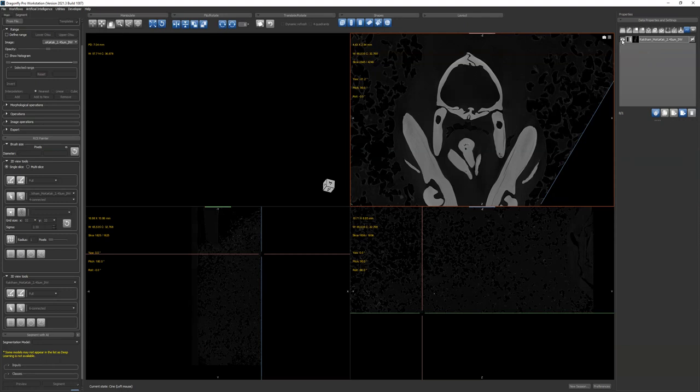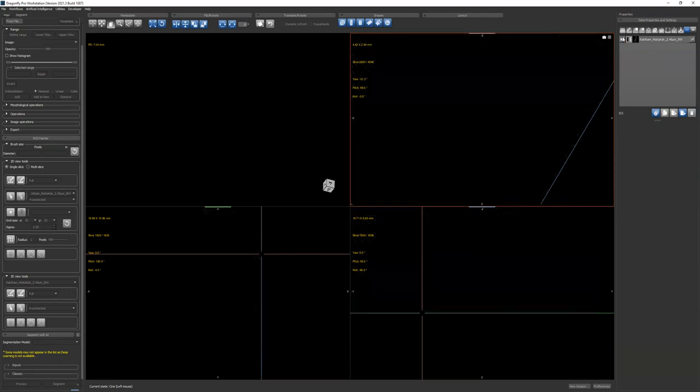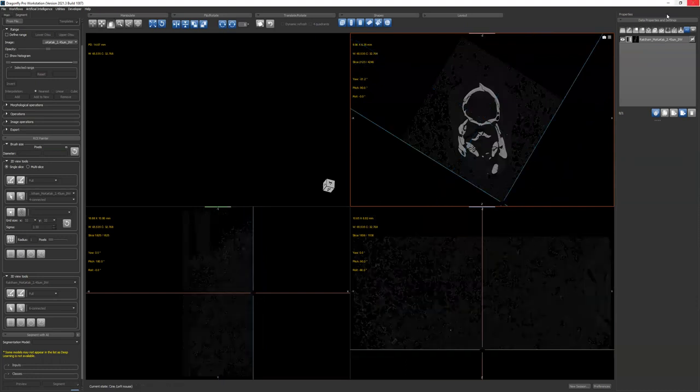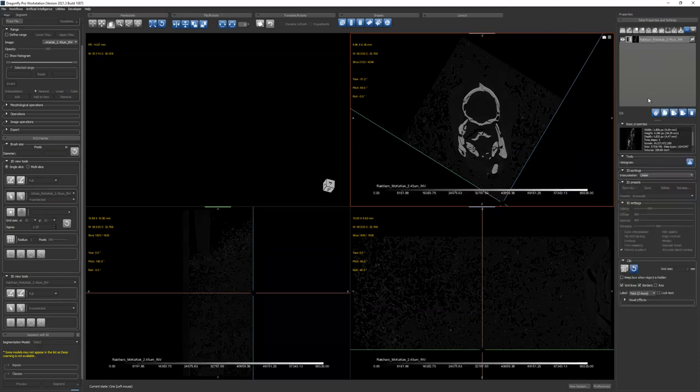I should mention that once the eye is off, you can't affect the data set at all. You can't use the data set. So you have to turn this eye on to see your data. So you might have this eye on, but you're clicking something else. So you're seeing what you think you want to work with, but you've got something else selected. You still can't use this. So even though I have this 2D view selected and I'm clicking the tools, why won't it let me? Well, you probably don't have it also selected here. That took a long time to figure out.